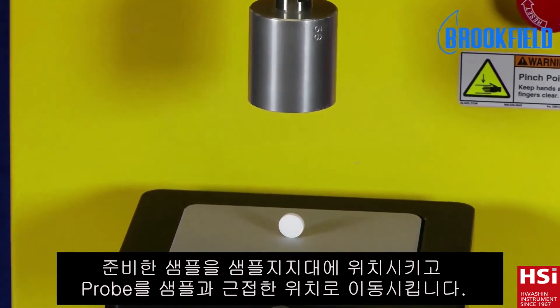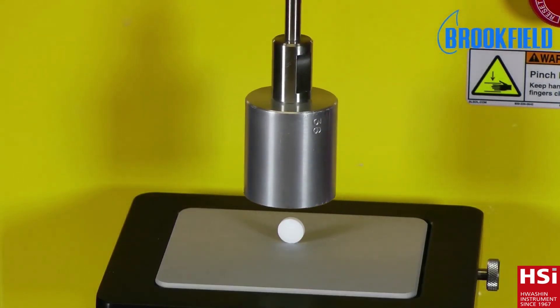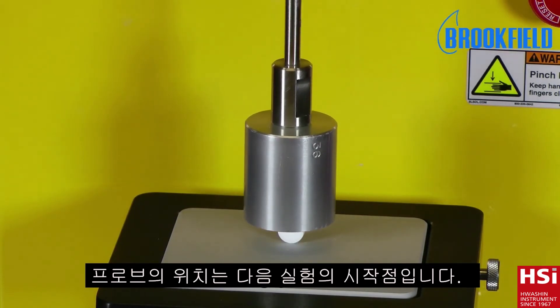To ensure that the tablet is centrally under the probe, lower the instrument arm to a few millimeters from the tablet surface. This can also be used as the starting position for the test.